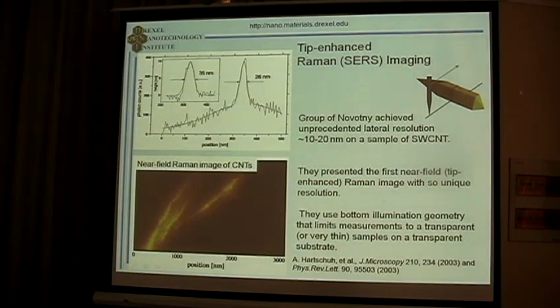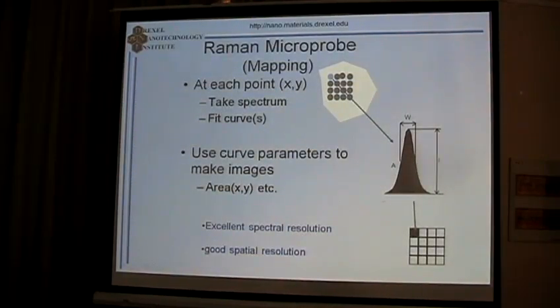So this is a nice thing that can be done on nanotubes, using nanotubes with surface enhanced Raman spectroscopy. Good. Well, there are a few other things.